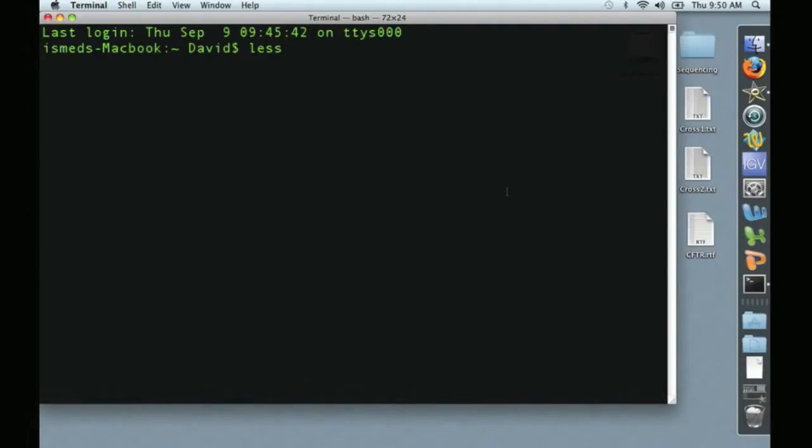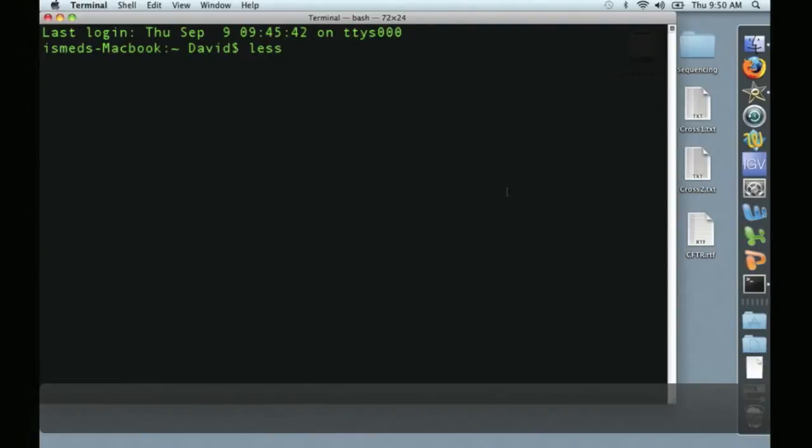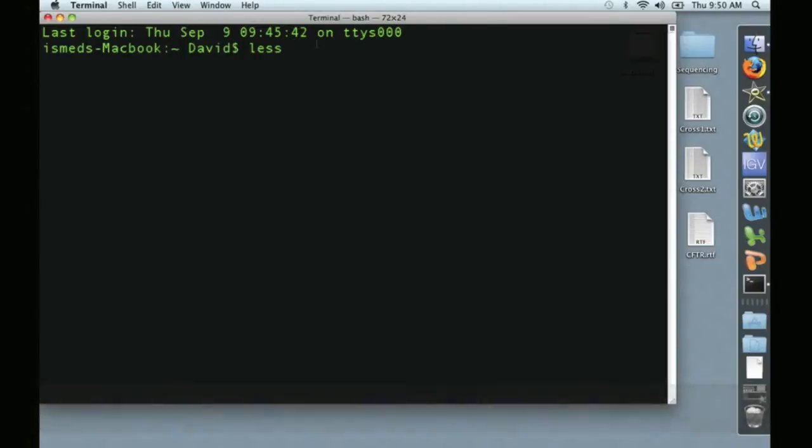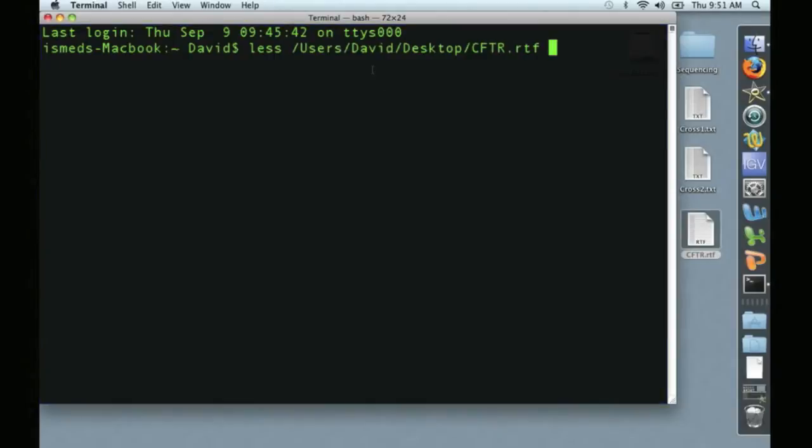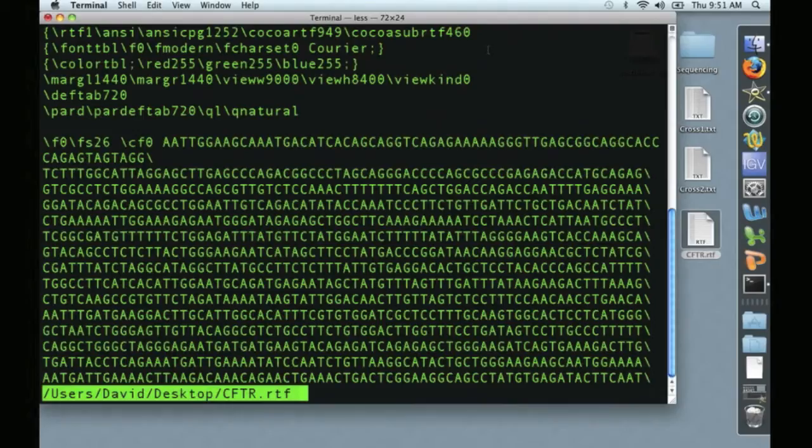To do that, we type LESS and then the file name, or we can drag and drop. Over here, I have a gene that I downloaded from GenBank, and I can simply drag and drop the file into the Terminal, and you see here displayed the path and file name. I press RETURN, and voila.